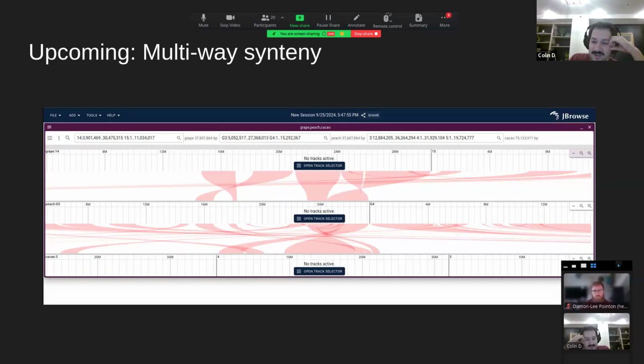And so there's some strategies like, we could tell the user only load the reads that are so-called badly paired. So that's a BAM flag, F2 or something. And then that actually would reduce the size of the BAM file a whole bunch, and it would give you the reads that are mostly informative for structural variants.